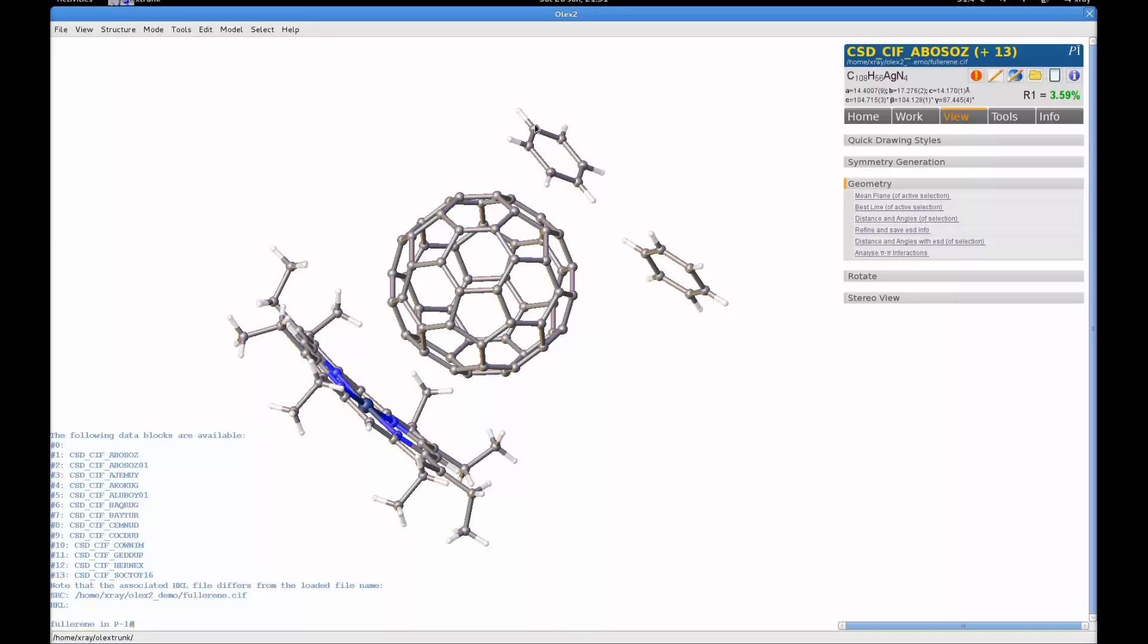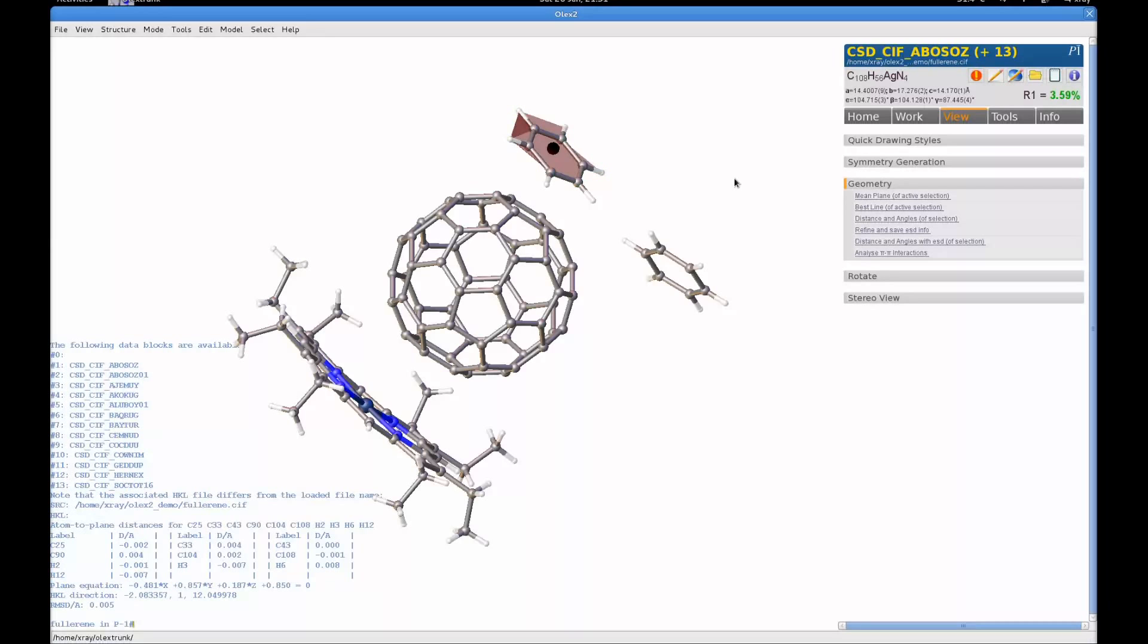Let's generate a mean plane for this ring. I can just use holding down shift and the left mouse button to draw this selection box, select a number of atoms, and click on the mean plane. That will generate a mean plane for all the selected atoms. As you can see, there's some information about that plane being posted into the console.